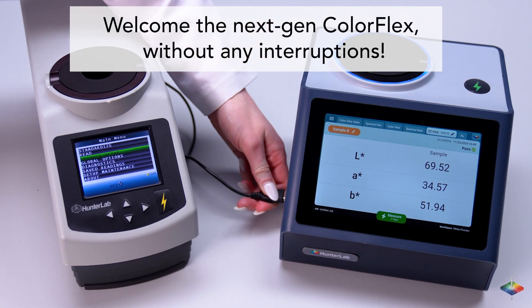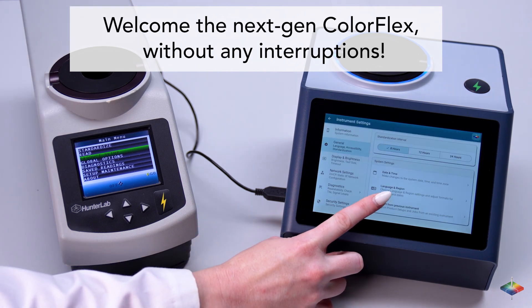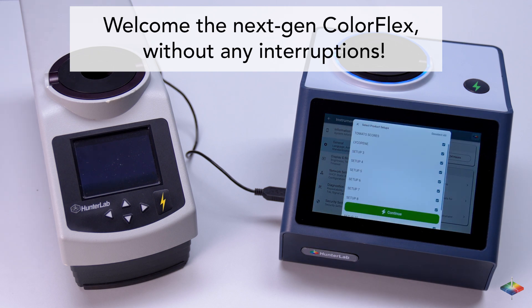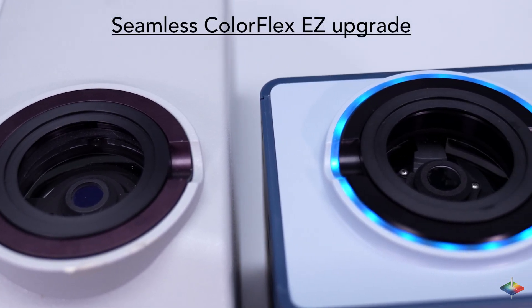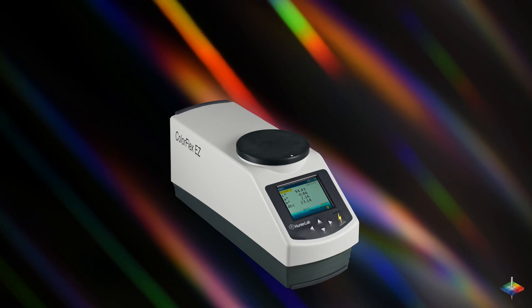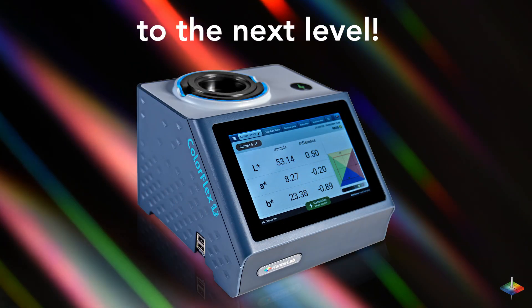We've upgraded the most reliable 45/0-degree spectrophotometer in the world, ColorFlex EZ, to the new ColorFlex L2, offering you an even better user experience without any interruptions. You can easily transfer your ColorFlex EZ standards and data to the ColorFlex L2. The same Xenon light source and 45/0-degree optics as the ColorFlex EZ provide a seamless transition from old to new. Simply put, we took the most relied-upon color instrument in the industry to the next level.